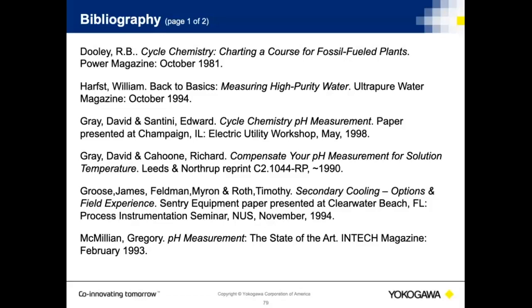Yokogawa just recently introduced smart pH probes, and the caveat with the FU24 is it needs to be used with the new FLXA402 analyzer. So the smart probe cannot be used with our older series of 402s or our pH450s. You must use the most current FLXA402 analyzer with smart probes.